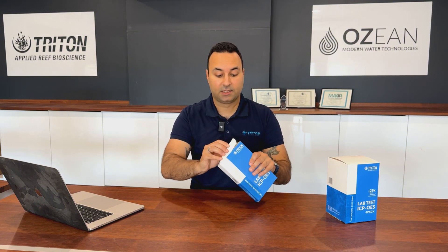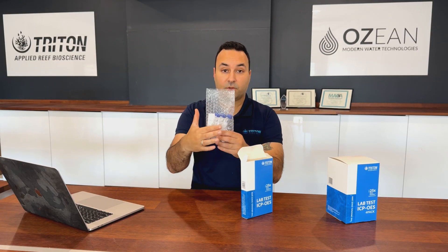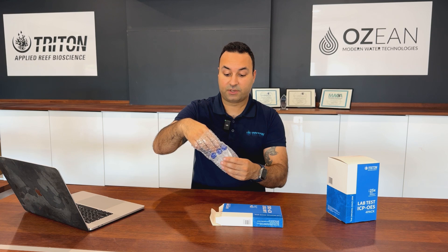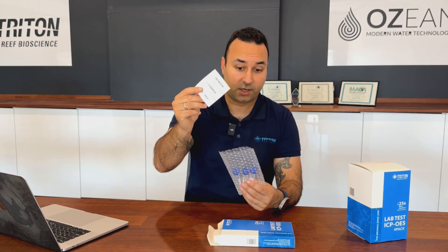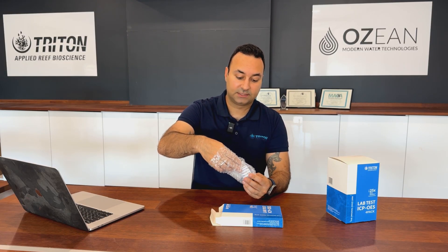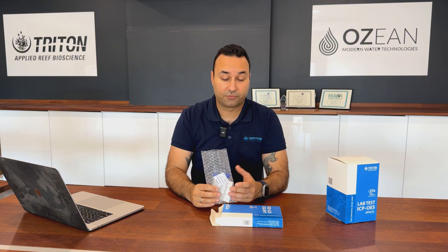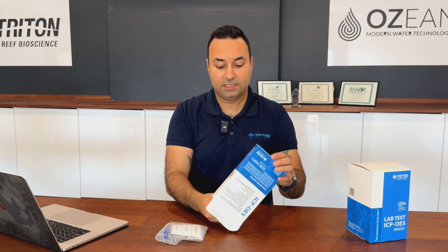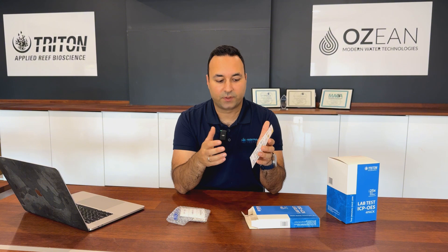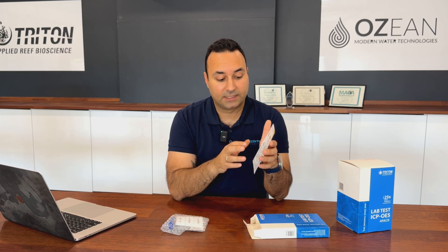Let's have a quick look inside one of these boxes. You'll find a bag with three vials that you send to us, three containers you fill with your water, and three barcodes which are very important for identifying your sample in the lab. There is also a sticker with the lab address depending on where you are in the world, and a little manual that guides you through the process so you don't forget anything.